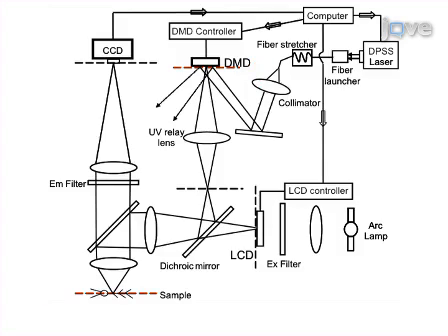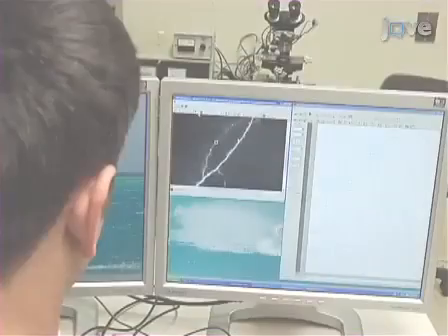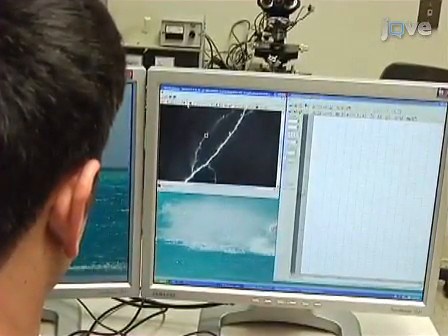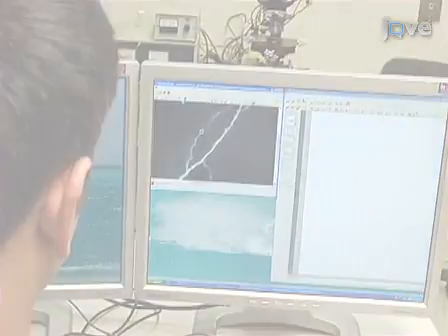the microscope. The second step of the procedure is to properly illuminate the DMD with an intense light source, such as a laser. The third step of the procedure is to eliminate the speckling effect of coherent illumination. The final step of the procedure is to integrate a graphic user interface to manipulate the DMD chip.